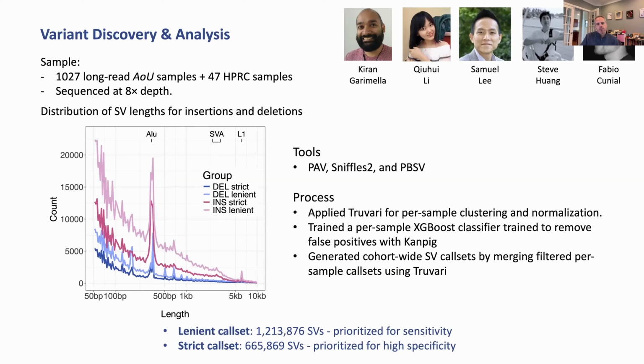I would say this all predates the SPRQ-Nx chemistry. If we had to launch this initiative today, we might dial up the amount of coverage. But at the time that we launched this, we were picking this modest coverage. Although we did a ton of benchmarking and a ton of analysis, this gives us remarkably good sensitivity and specificity at 8x coverage.